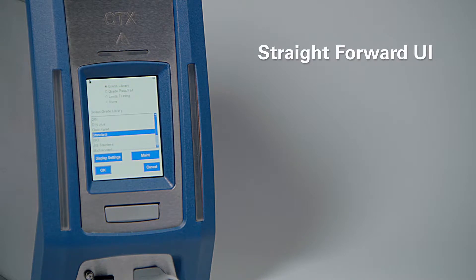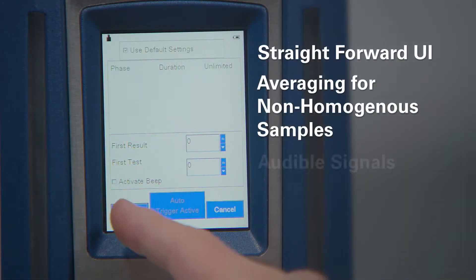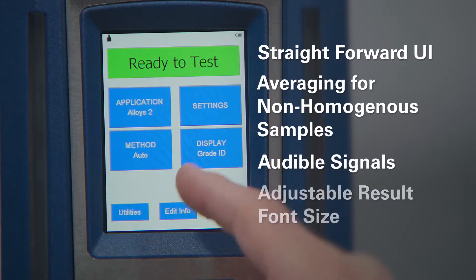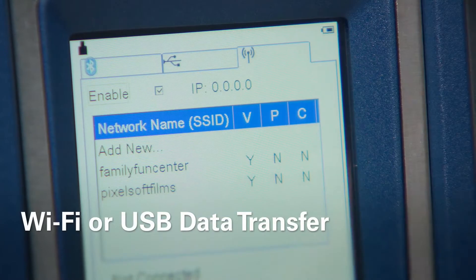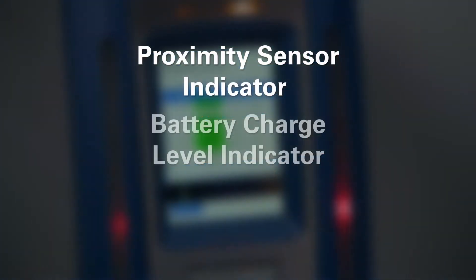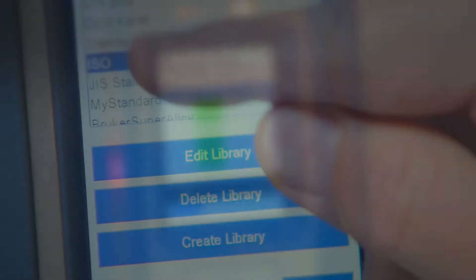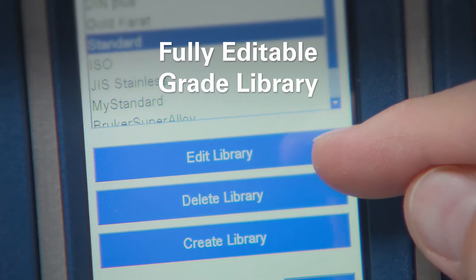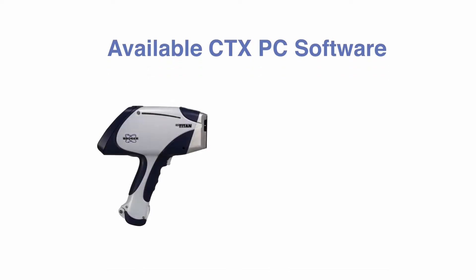These features include a straightforward user interface, averaging for non-homogeneous samples, batch evaluation, audible signals, adjustable result font size, two user levels, Wi-Fi or USB data transfer, Bluetooth connection, proximity sensor indicator, battery charge level indicator, limits testing available for all calibrations, and a fully editable grade library.